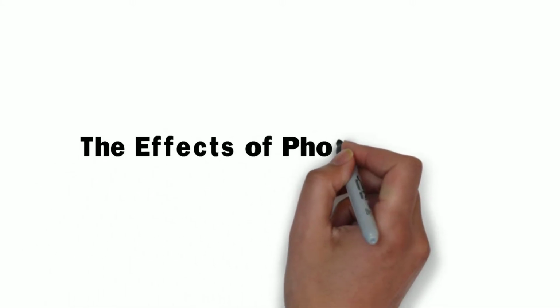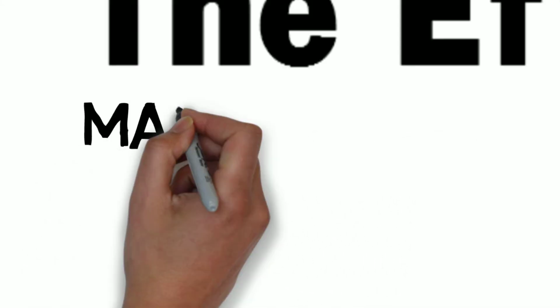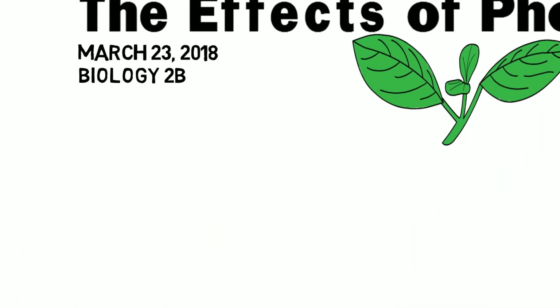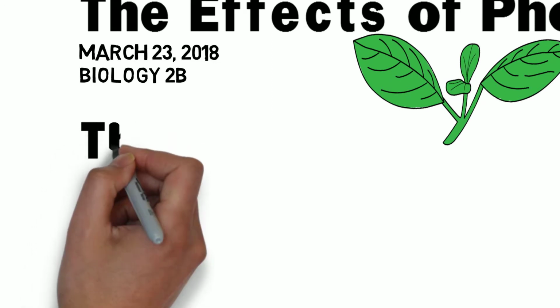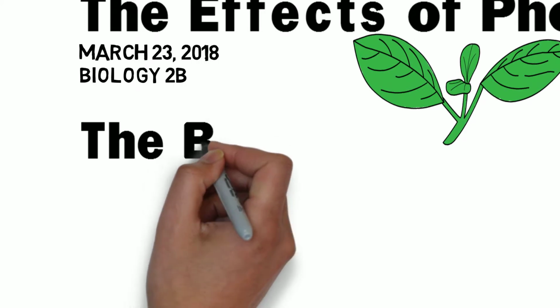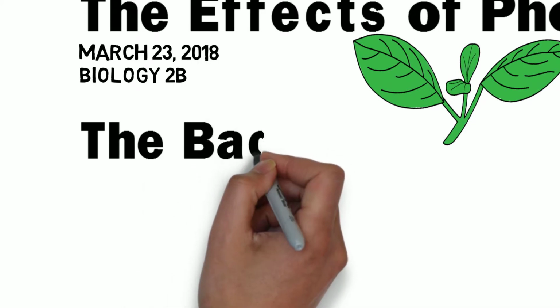The effects of phototropism. March 23rd, 2018, Class 2B. Good morning, scholars. Our experiment is focused on the reaction, which is phototropism.